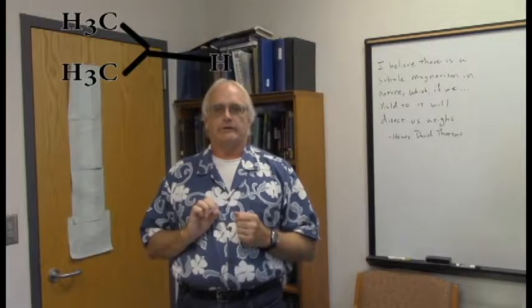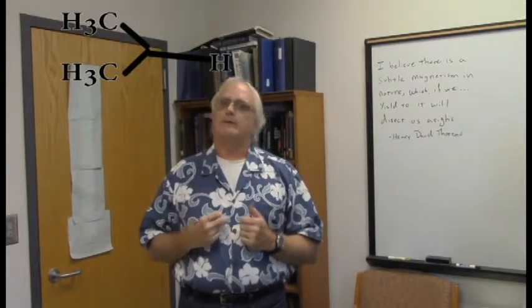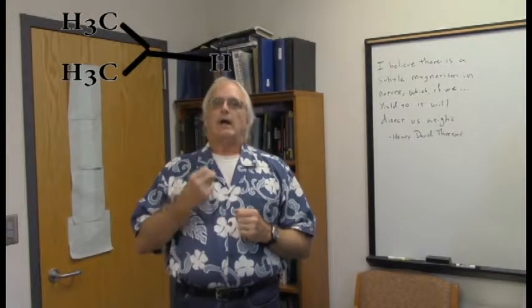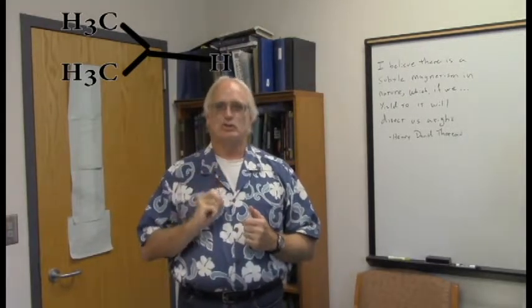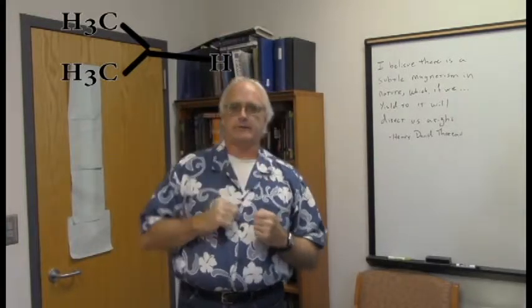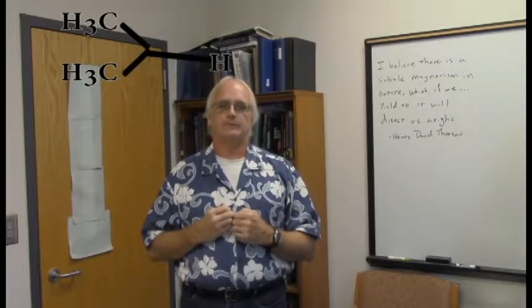Now the next question is, can we take this step? Can we go another step? Can we use the COSY to find any more protons? And so now we take this position as our known position. We know this CH group. Can we use the COSY to step to the next carbon? Is there some group of protons over there that this is coupled to?